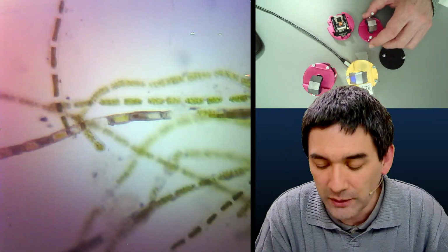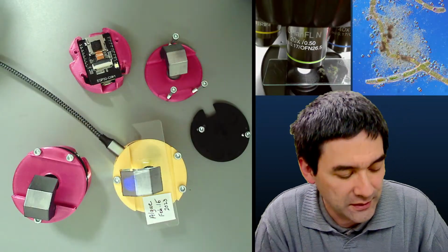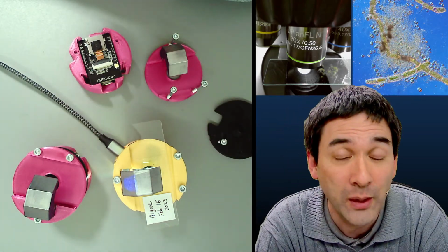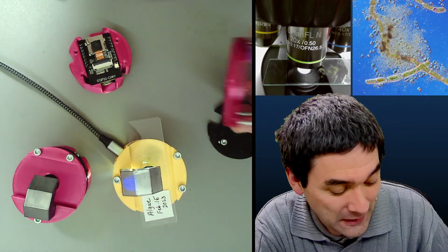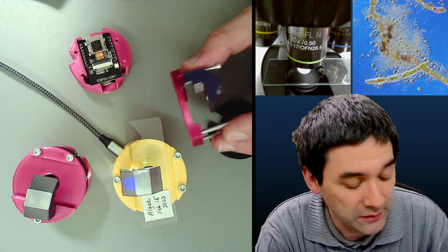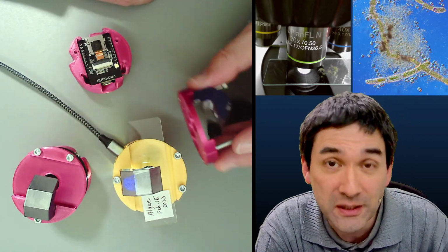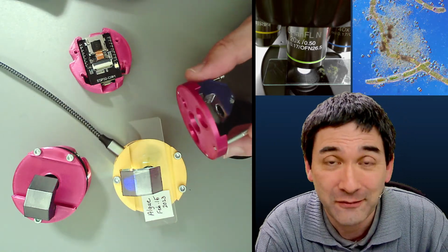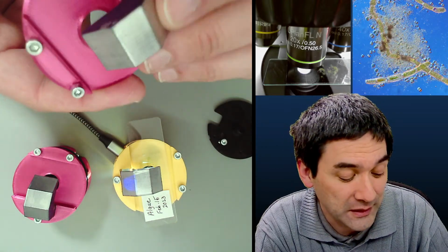Look kind of nice. So what I'm going to do now is show you a little bit how this project microscope is designed, and the question is why would anyone use something like this if we already have full microscopes? What's the advantage of this here? I think the advantage, besides the low cost, is that it's a fun project. I am a teacher, and if I want to do some do-it-yourself projects with students, this is certainly something that can be done.